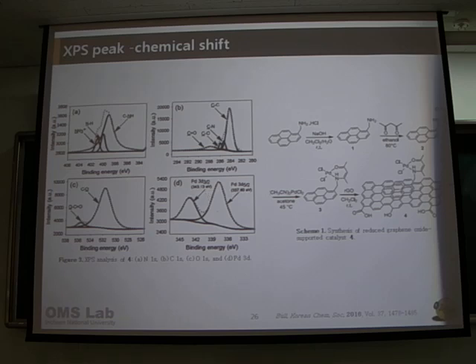So you see that if there is no coordination, it will have a C=N double bond. But here it is not a double bond, so it has a C-N single bond peak and this peak. That is evidence that this imine peak has been converted to this enamine peak through this palladium.